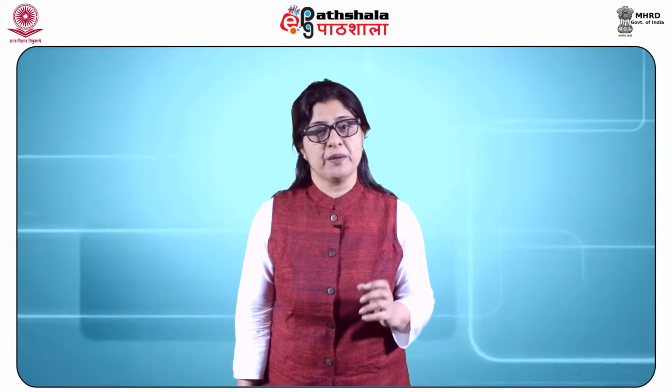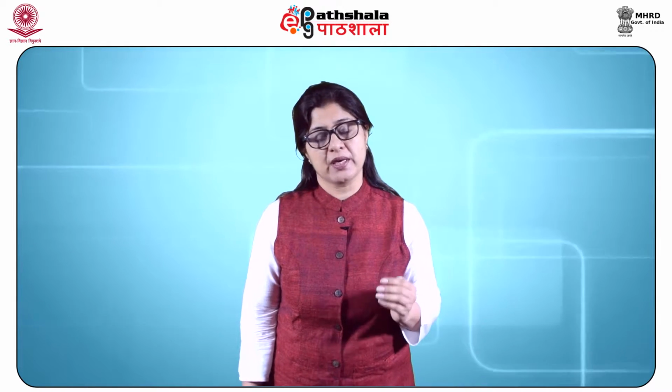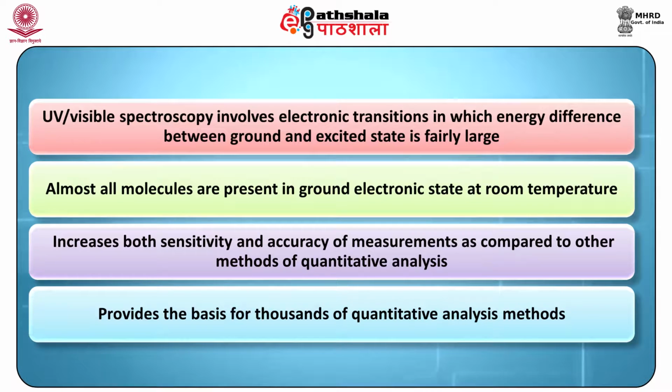UV visible spectroscopy provides a highly accurate method for quantitative analysis. Let us try to understand why. UV visible spectroscopy involves the electronic transitions in which energy difference between the ground and the excited state is fairly large. Because of this, almost all the molecules are present in the ground electronic state at room temperature. It increases both the sensitivity and the accuracy of measurements as compared to the other methods of quantitative analysis, and thus provides the basis for thousands of quantitative analysis methods.